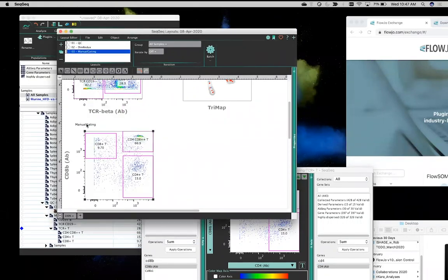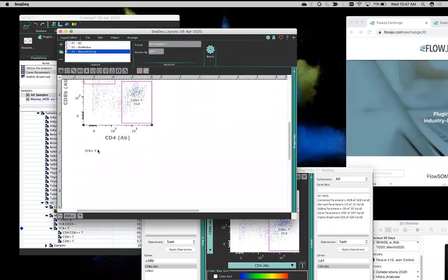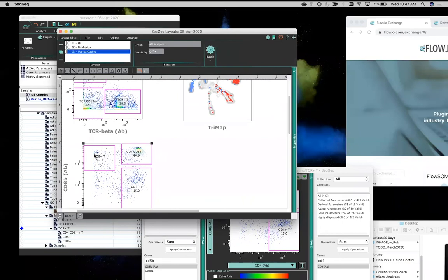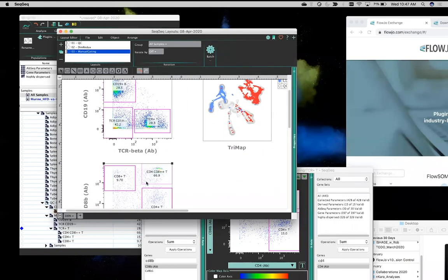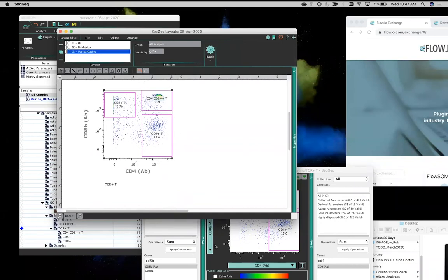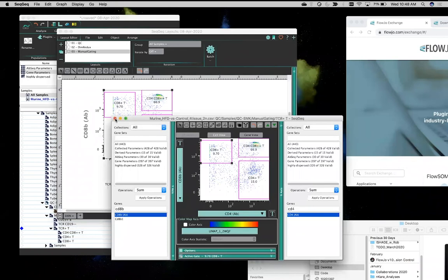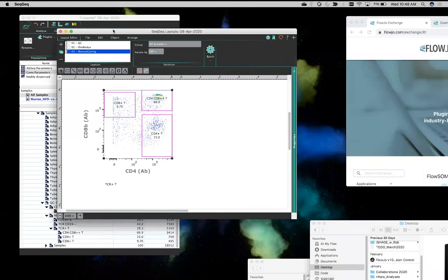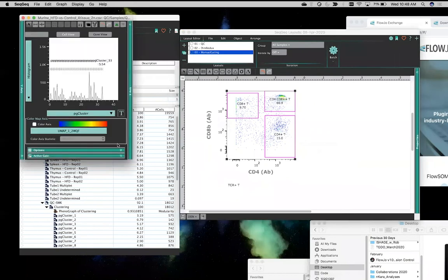And I'm going to go ahead and remove that layer name from here, but I'll leave the subpopulation already listed here, TCR positive T cells, so that we know exactly where this set of gates comes from. So we can trace the origin of the gating tree as we go through that. Okay, not going to go any deeper on T-cell subpopulations, but you can see that there's a huge number of combinations of bivariate parameters that we could look at if we so choose.